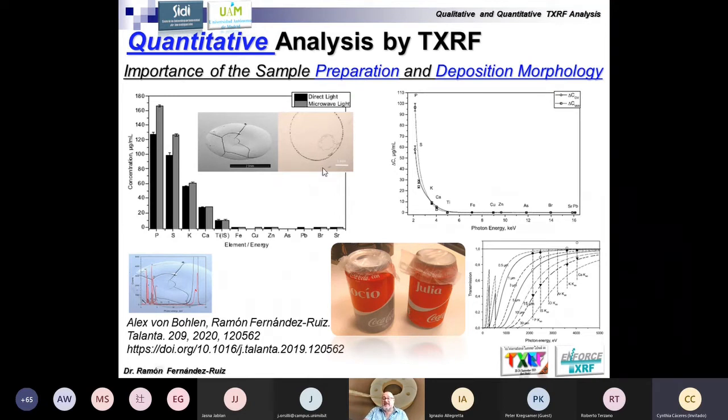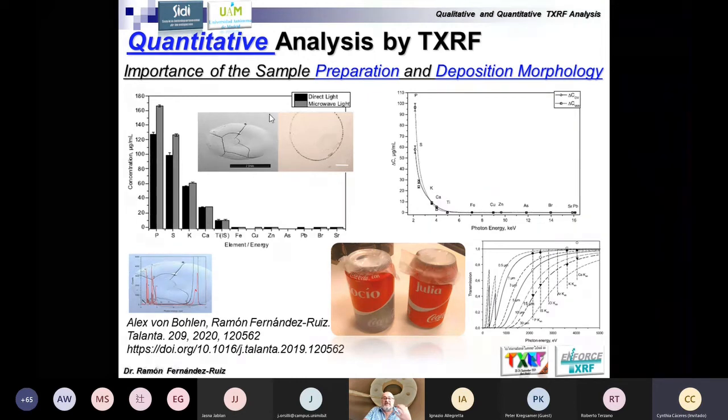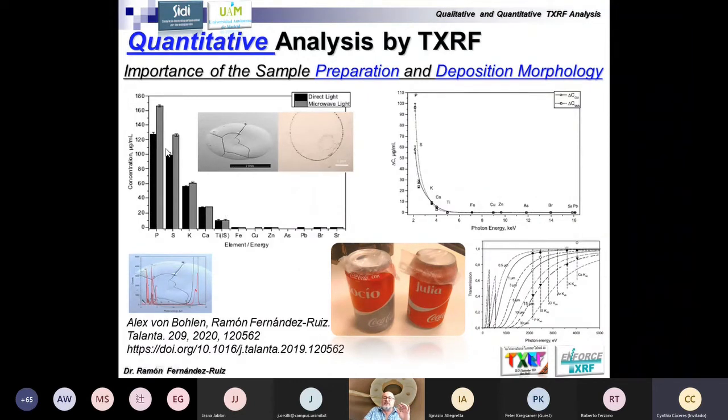In this case, if we only made a very simple preparation, our results are not going to be so good. But if we prepare from the first moment by a complete digestion, minimizing the possible matrix effect, the possible absorption, the deposit over the surface, it's possible that we can obtain very good results. It's okay, only as a conclusion of this.